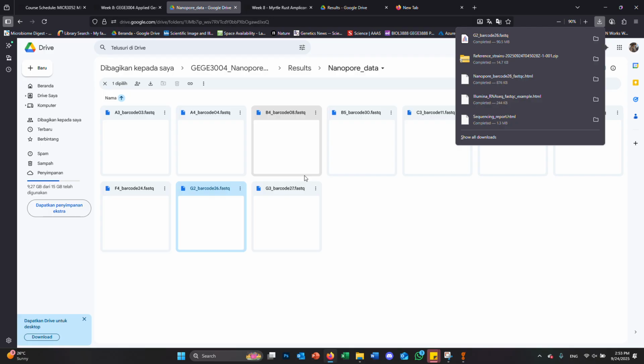Today we're going to use a different piece of software called Minimap2. You can actually use this via the command line. If we'd installed it on the virtual machine, we would have done it that way, but we haven't. So we're now going to install it into Geneious. You have to go to the Tools toolbar, go to Plugins and select Minimap. I didn't realize you had to do this until this morning when our lovely demonstrator, Eloise, said, oh, Minimap's not in my thing. And I'm like, oh yeah, that's right. I installed that one for myself probably a couple of years ago. So I've already installed it, but you just need to click on the install button and it shouldn't take too long. That's the extra step that I have included.